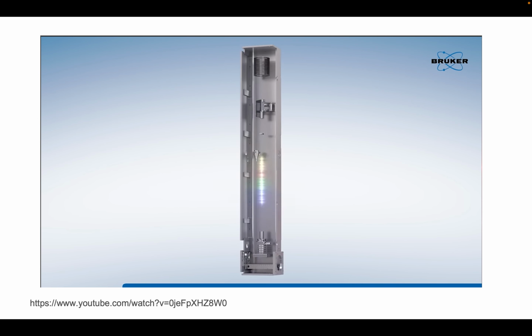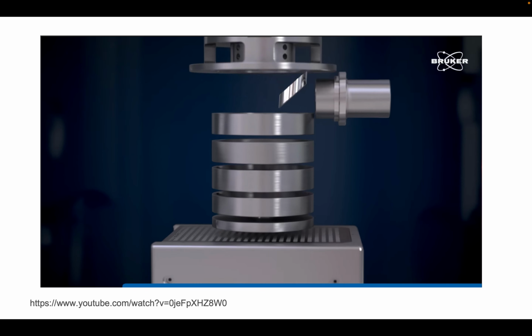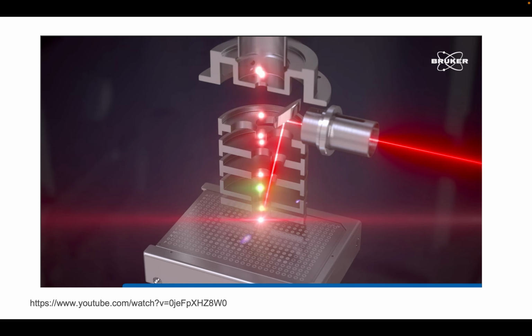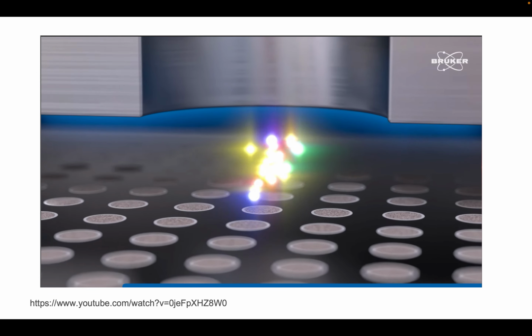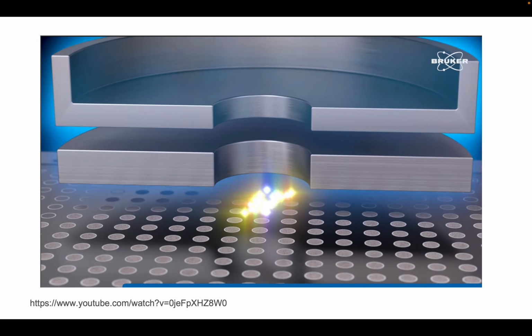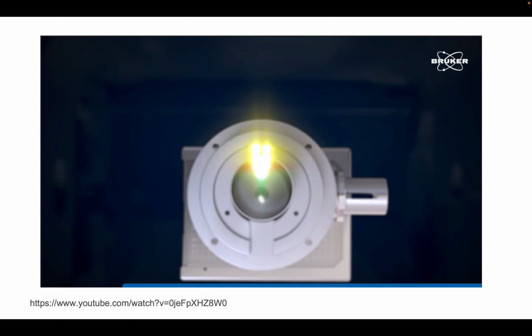The MALDI-TOF process is a two-phase procedure. Initially, the samples are fixed in a crystalline matrix. In the initial ionization step, they're bombarded by a laser. The sample molecules vaporize into the vacuum while being ionized at the same time. High voltage is then applied to accelerate the charged particles.